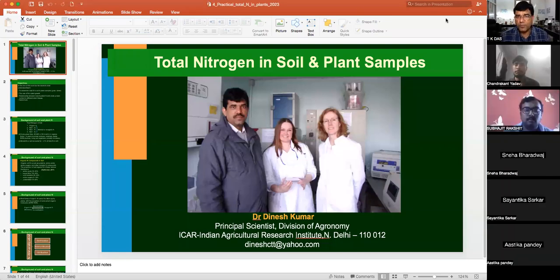Dear students, you are welcome in this class. Today we are going to have a practical on total nitrogen estimation in soil as well as in plant sample.